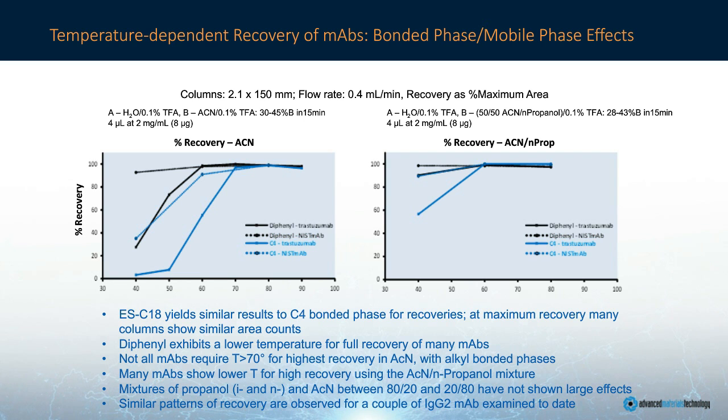On the left graphic, you'll see this is a percent recovery study that was done with trastuzumab and NISTmAb, and the black trace was an analysis done on a diphenyl phase, and the blue trace is an analysis done on a C4 phase.